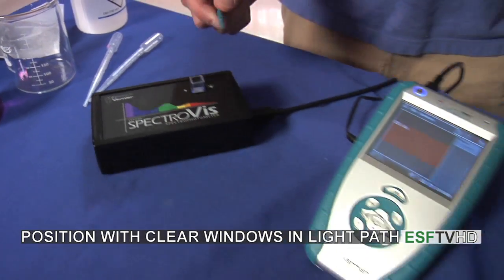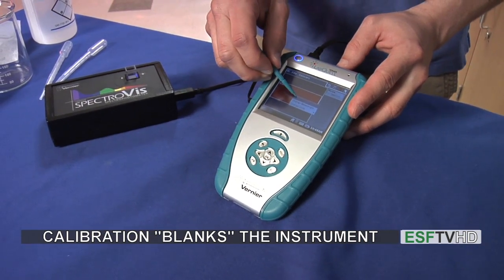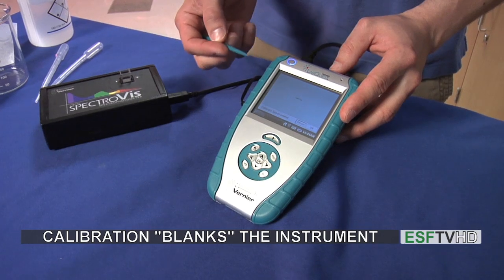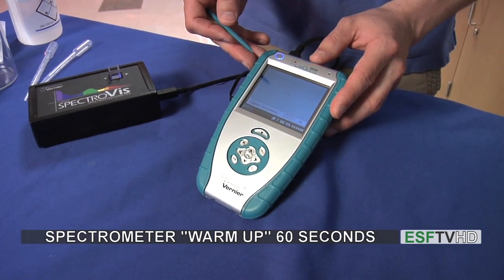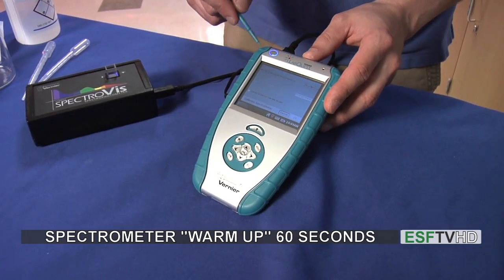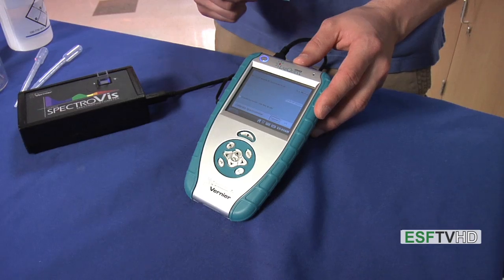Back at the LabQuest, I'm now going to tap the red box and hit calibrate. That calibrate is going to blank the instrument. The first thing it's going to do is ask you to warm up the spectrometer for 60 seconds, so we're going to let 60 seconds pass and let it warm up.